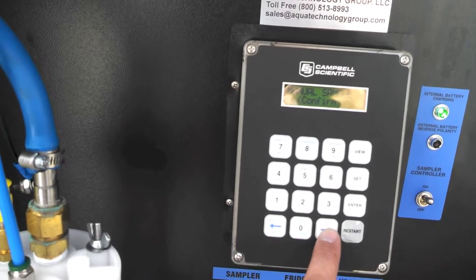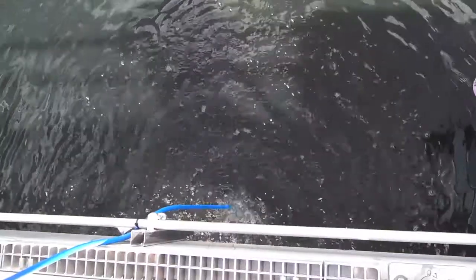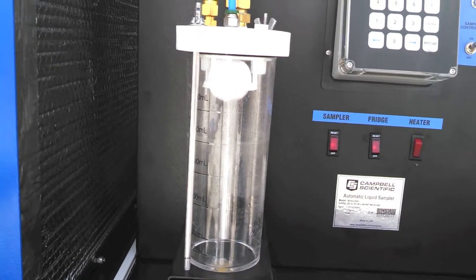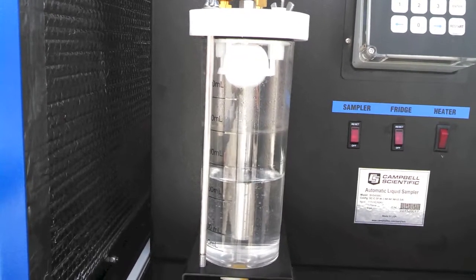I'm going to go ahead and take a manual sample here. Now we're pre-purging the line — you can see it's bubbling up here. Now we've made the purge and the pre-purge. We're going to take our first suction in.